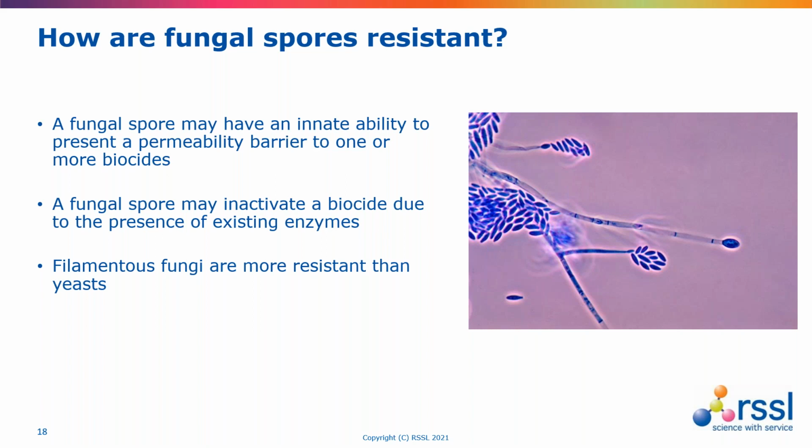And also the sheer numbers, as I mentioned, there are a lot more fungal spores present at any one time, and if they've been dispersed around the clean room, it can be more challenging to ensure that all of them have been eliminated, and their ability to spread is quite difficult.